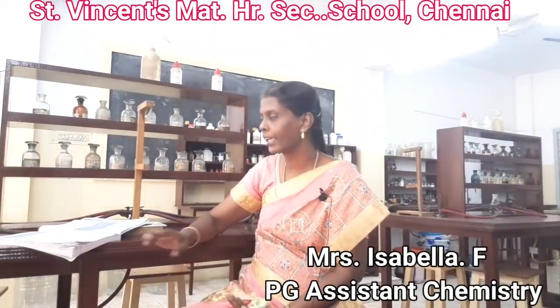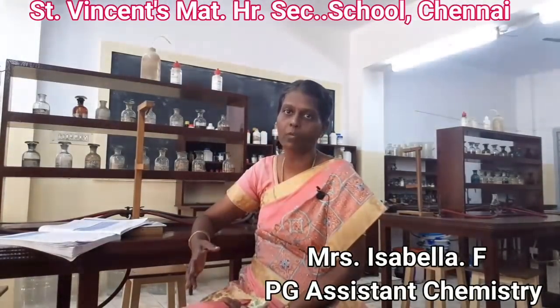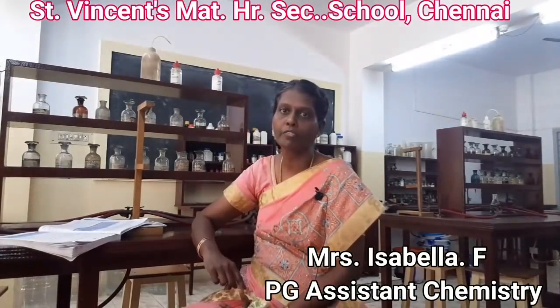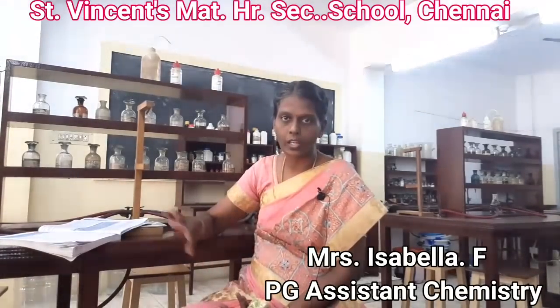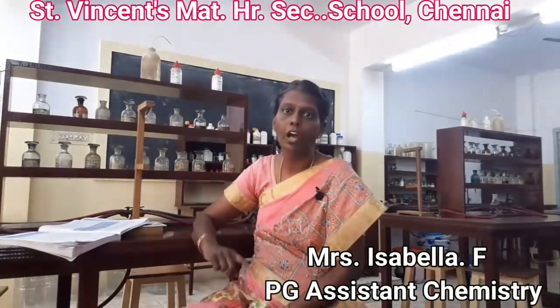Now when you are doing the calculations, you may get confused as to what is V1, what is N1, and how you should take it. So remember that always V1, N1 will be for the unknown solution. That means the one for which we are finding out the normality, and V2 and N2 will stand for the known solution. So identify these solutions, and when you do the calculations, as I told you, V1 and N1 will stand for the unknown solution, V2 and N2 will stand for the known solution.